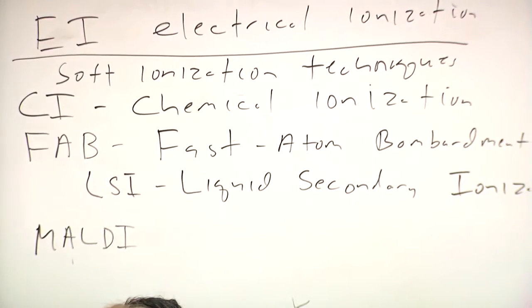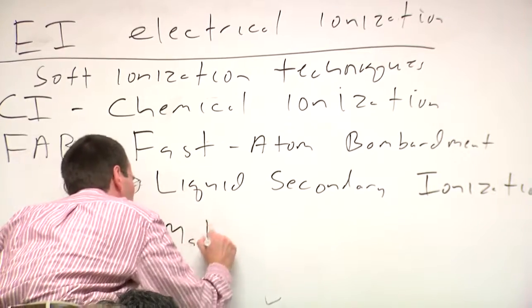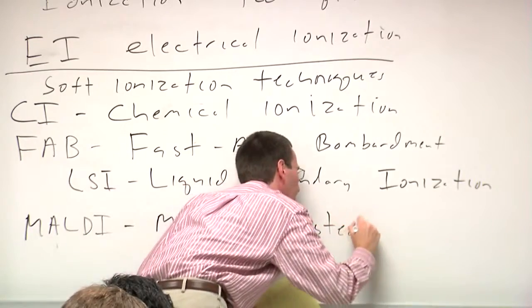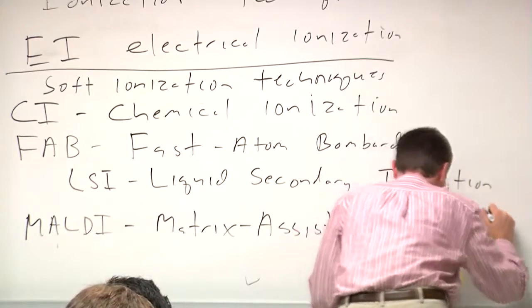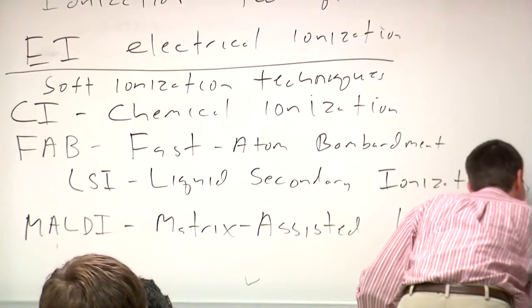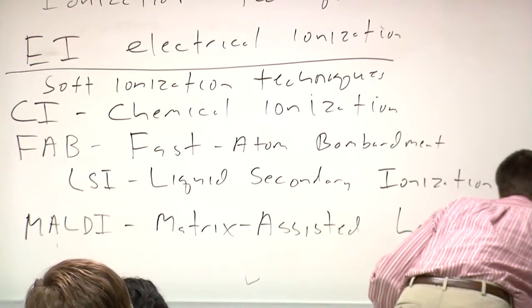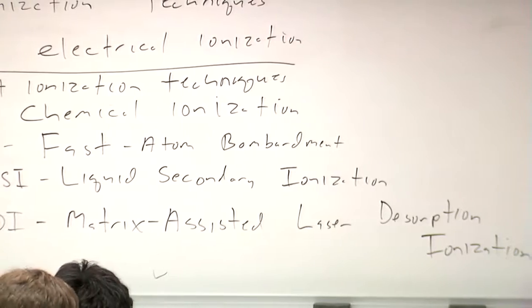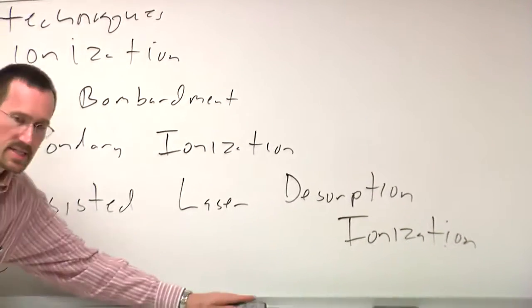It's matrix-assisted laser desorption ionization. I'll talk more about all of these techniques in a second.